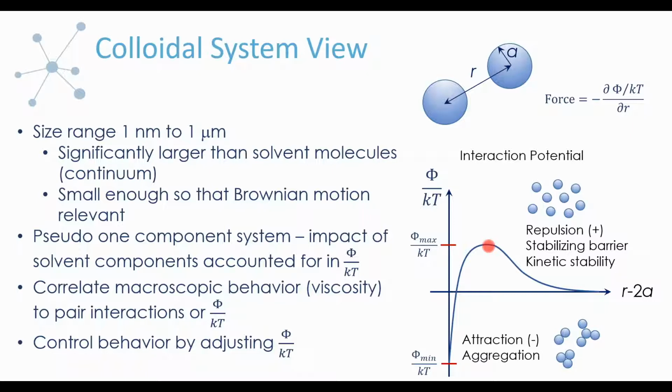And these counter ions, depending on the charge density, will occupy a particular space, a distance away from the molecule, giving you a different range on the repulsion. The density of them will then also give you a magnitude. Then as you add salt into the system, you start to shrink this layer down, and what's happening is you're screening the electrostatics, which is the general term that you use for this. So that's going to be the relevant type of interaction for our systems today.